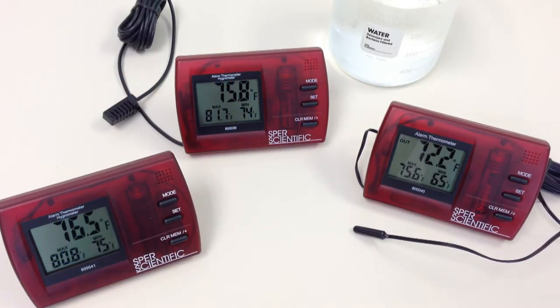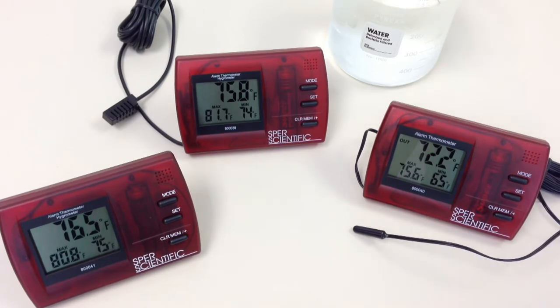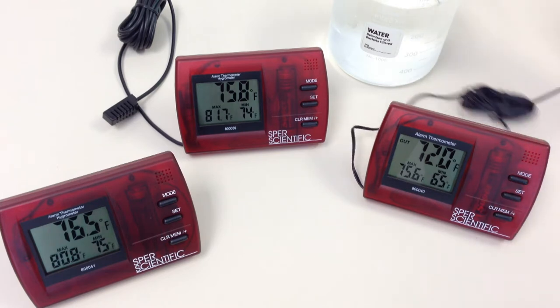These alarm thermometers and hygrometers enable you to set minimum and maximum temperature and humidity alarms and recall the results. When the temperature or humidity exceeds your preset parameters, an audible alarm will sound.